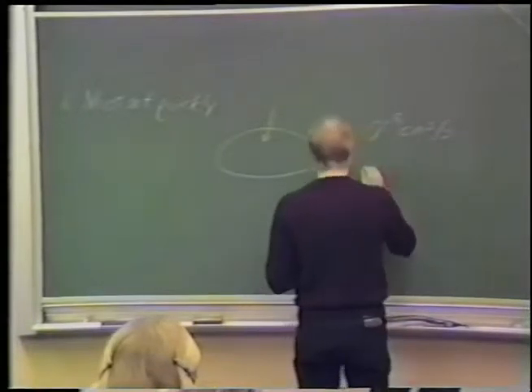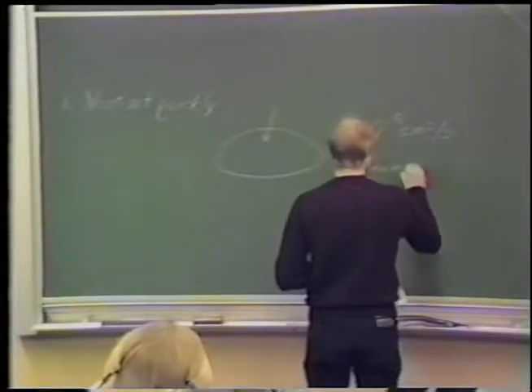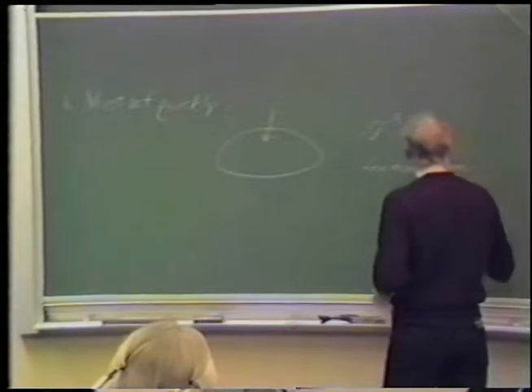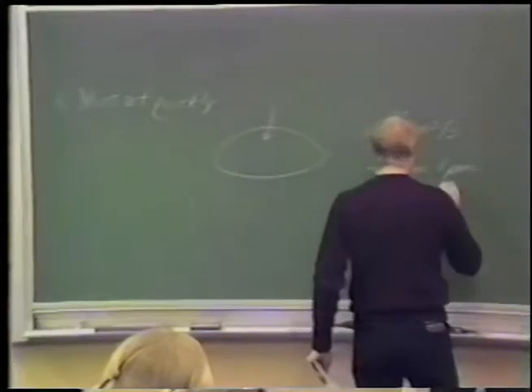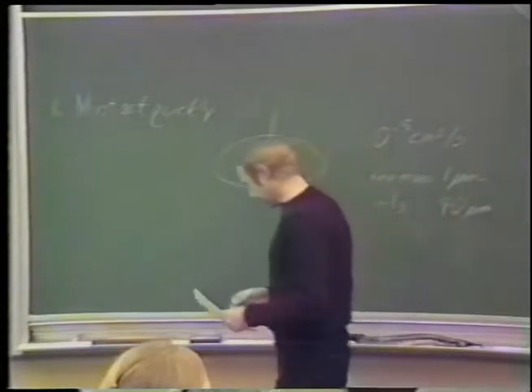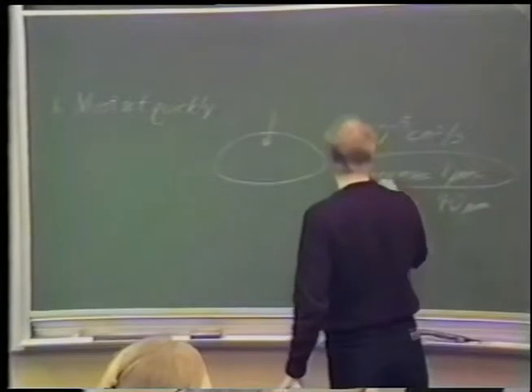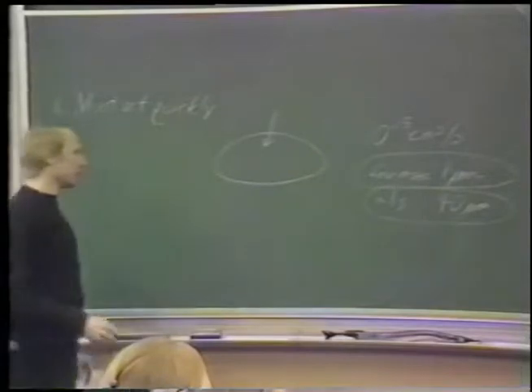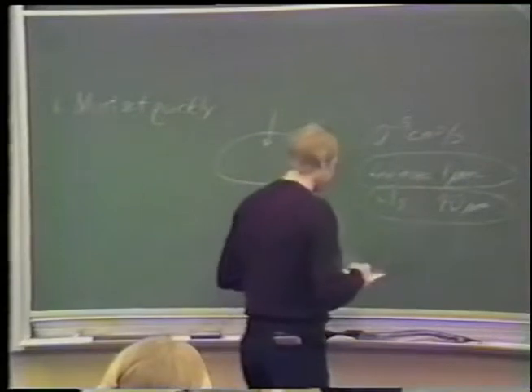And the calculation shows that a few milliseconds are required for a fixative to completely penetrate a 1 micrometer thick planar sample, and about 1 second is required for a sample of about 40 micrometers thick. This is reasonable. This is pushing it for transient events. Most samples are larger than that, or at least of this order.